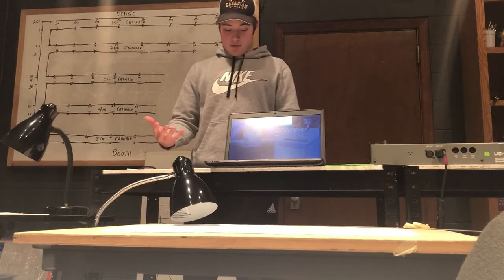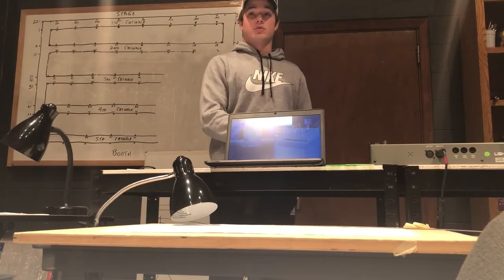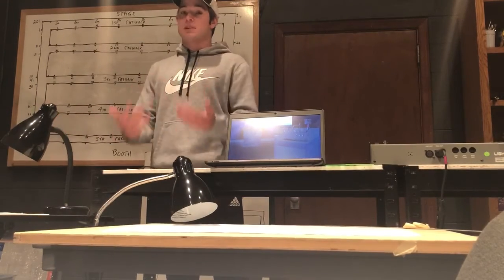So now, in conclusion, I have taught you how to dissect a squid, the safety procedures for beginning, how to actually perform the dissection, and then what to do after that dissection is over.